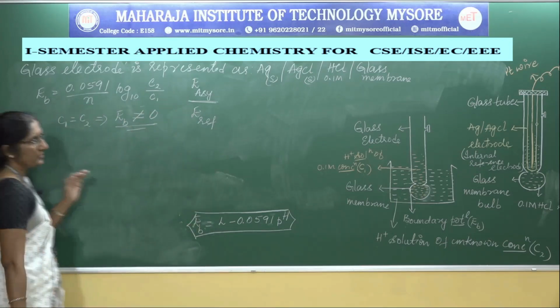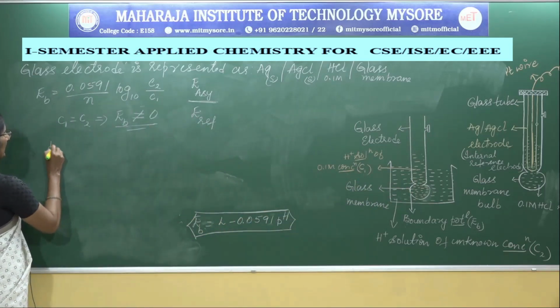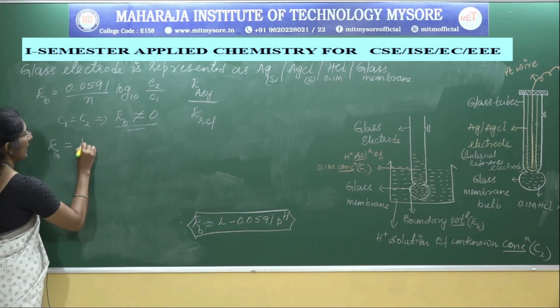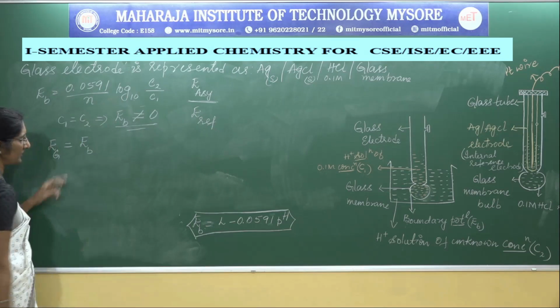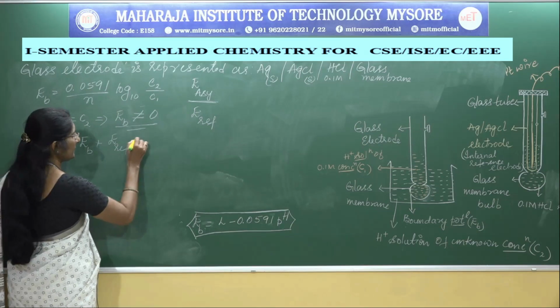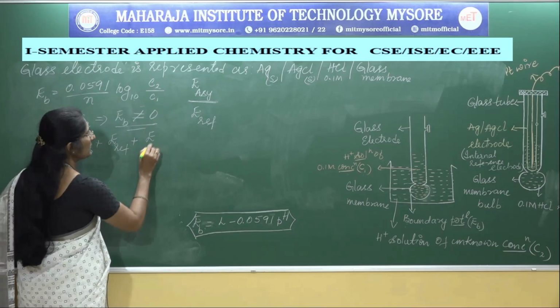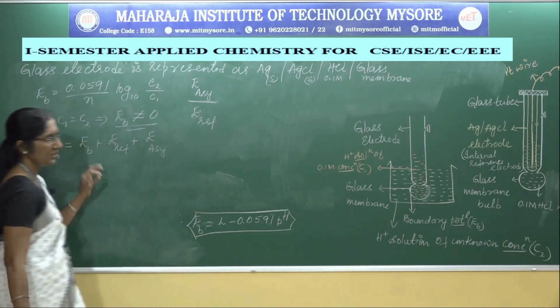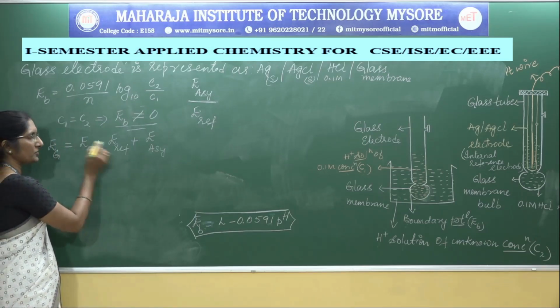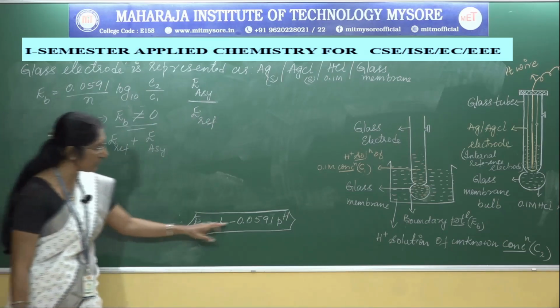So the potential developed at the glass electrode, abbreviated by EG, is the sum of the electrode potential developed at the boundary, that is the boundary potential, plus the reference electrode potential, that is E reference, and a small potential developed when concentration C1 is equal to C2, that is the asymmetry potential. So the potential developed at the glass electrode is the sum of boundary potential, reference potential and asymmetry potential.